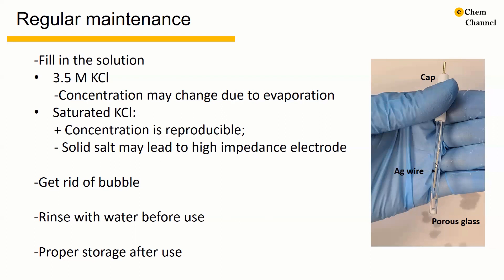Before use, we need to get rid of bubbles by gently knocking on the electrode. Now we have rinsed the electrode with water. After each use, we need to store the reference electrode properly. Because the porous glass part is very fragile, it's better to keep the reference electrode vertically and always immerse it in saturated potassium chloride.